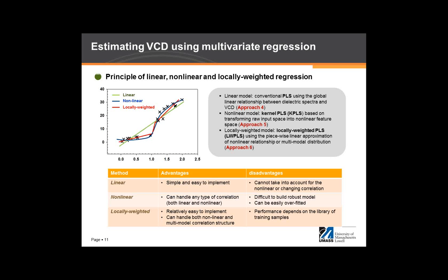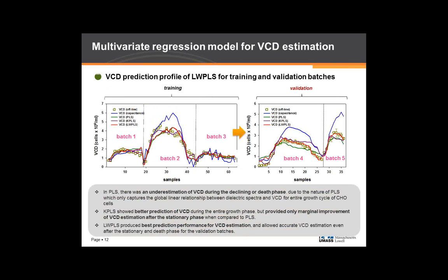It means that when the cell is getting into the plateauing period and declining phase, somehow we can take care of those morphological changes in our model. So we tried those 3 different types of methodology to take into account fundamental changes during the cell growth and declining phase.